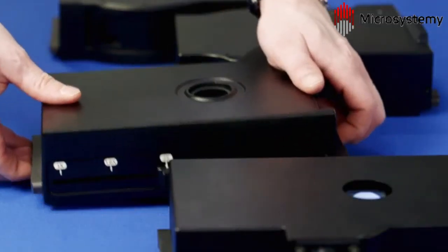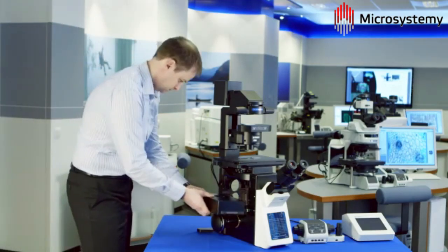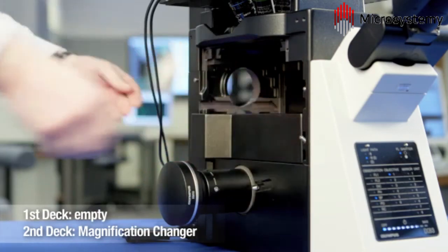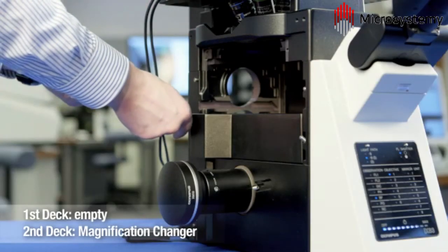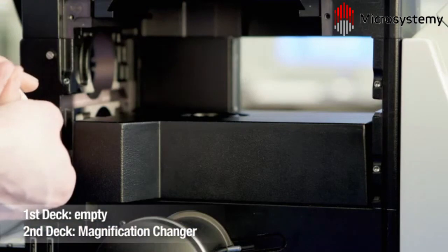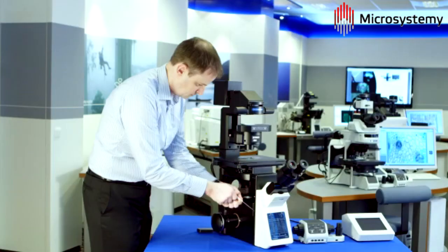A range of optical modules is currently available for effortless integration into the light path of the IX3 frame. With the included tools, installation is quick and easy, as shown here with the encoded intermediate magnification changer, which allows precise control and recording of settings between 1, 1.6, and 2 times magnification.